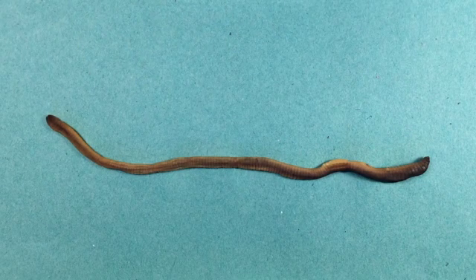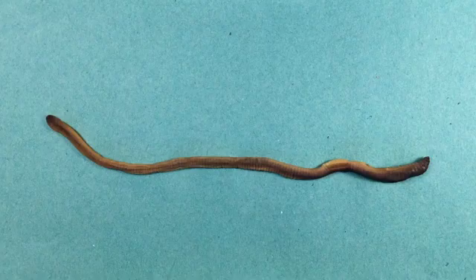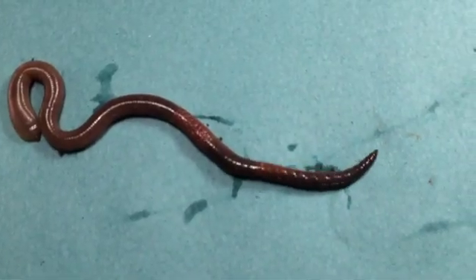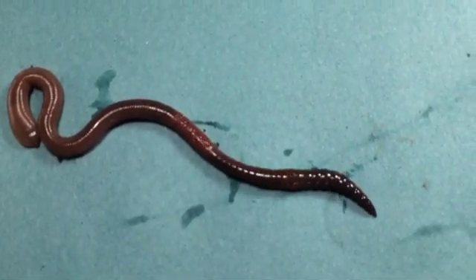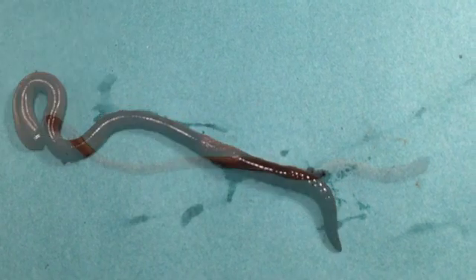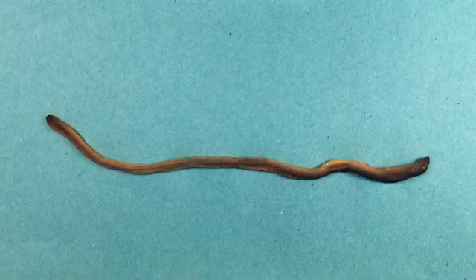First let's orientate this specimen. We want to know where we're cutting when we start dissecting — what's lying underneath our knife. With live specimens it's quite obvious which the head end is, as the worm will be moving forwards leading with its head and feeling its environment. But obviously we can't go by movements with a preserved specimen.